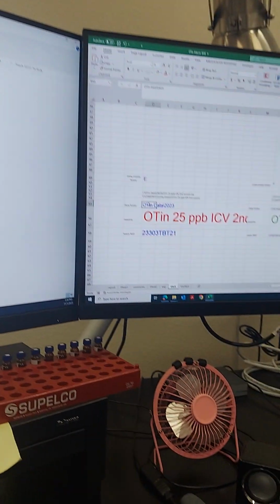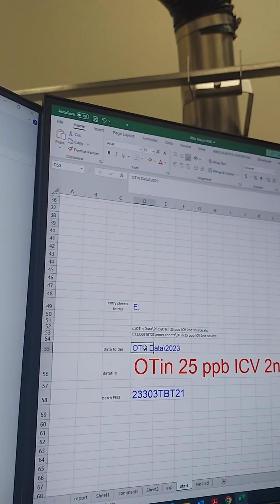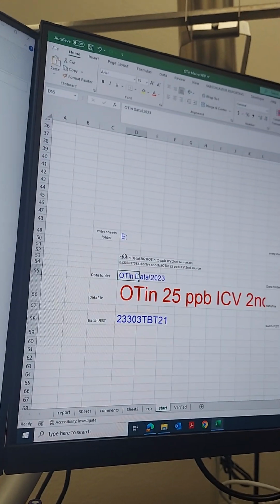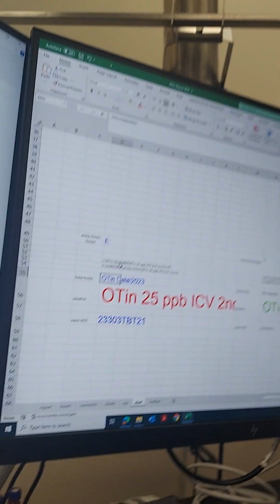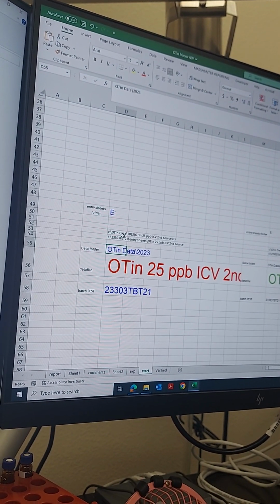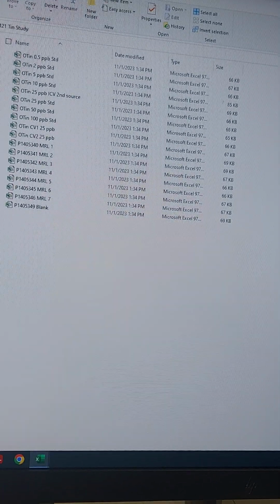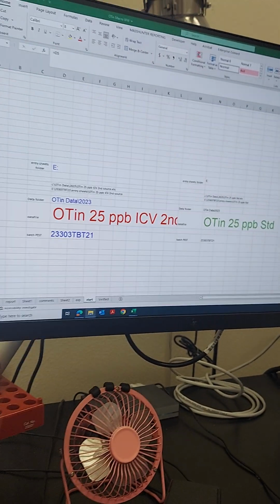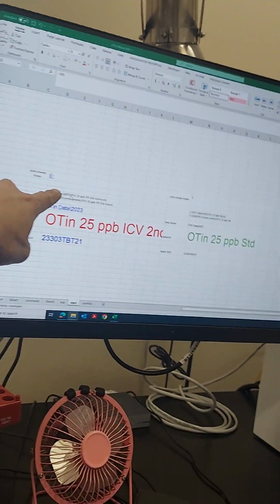Okay. This looks wrong. It's set up to do it in the C drive. Yeah, you need to put this in the C. I think so, because when you report the files, you report this address in the evaluation report. You need to put this.